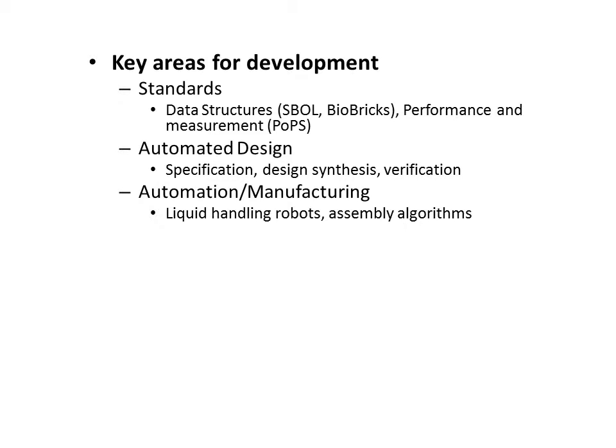If I tell you to go build a part out of GFP, you pretty much understand what I mean, but you must inject a great deal of knowledge and make many micro decisions in order to implement the experiment. For example, should you make a BioBrick part or a Golden Gate part? Or can you do anything you want? Which GFP? What codon usage should I make the GFP out of?